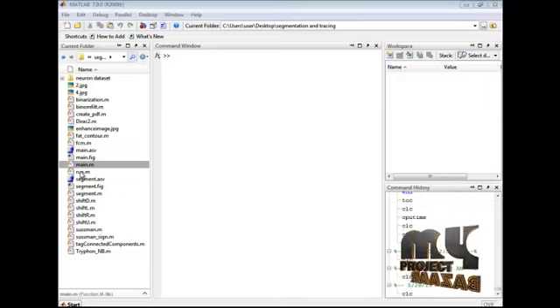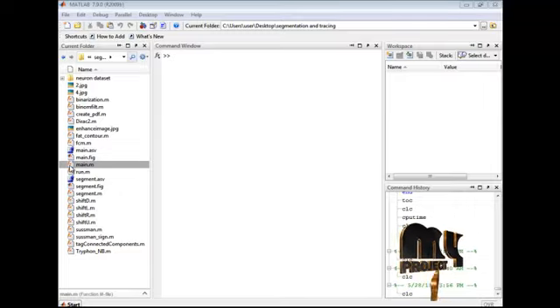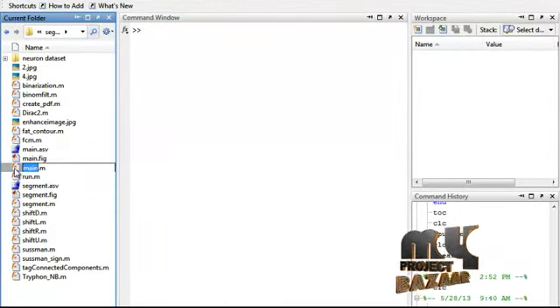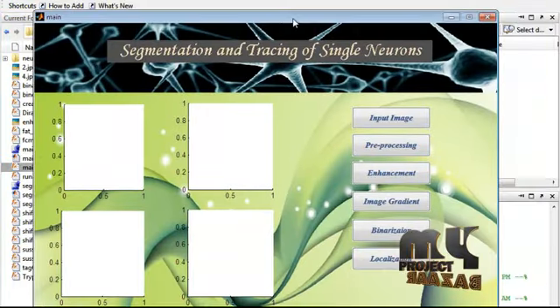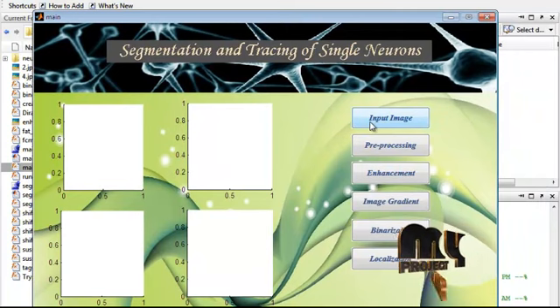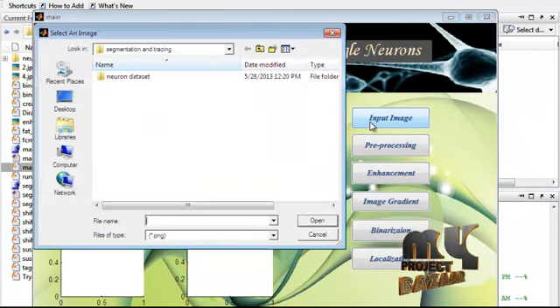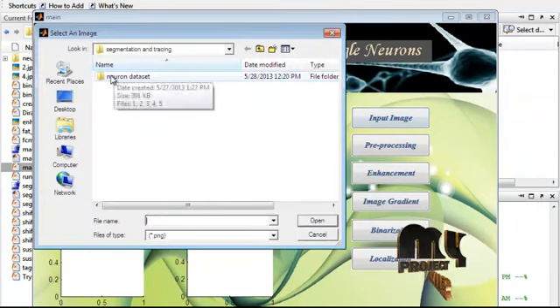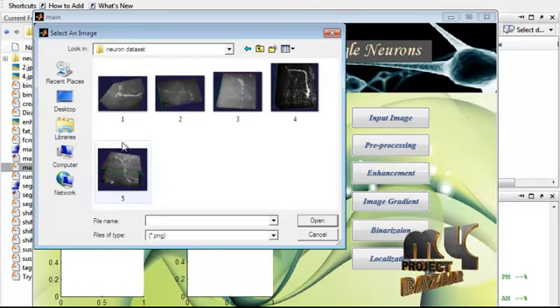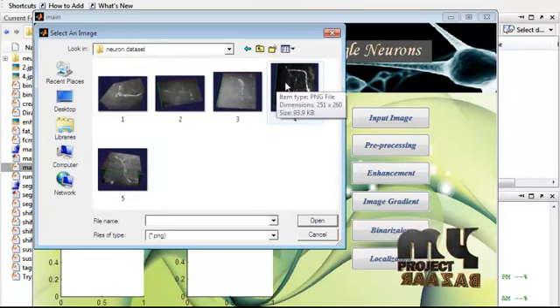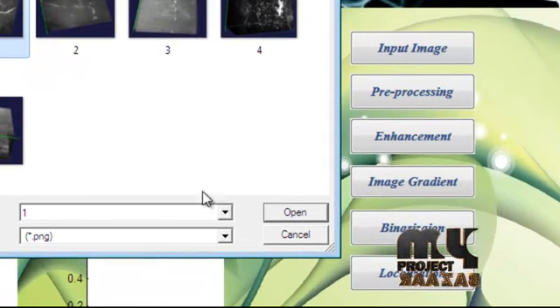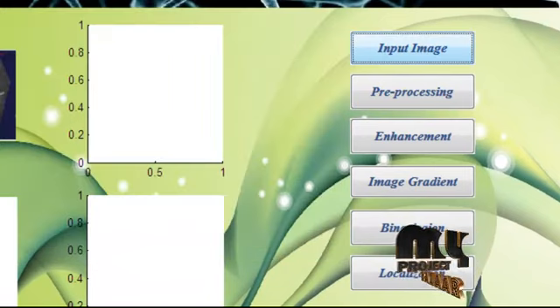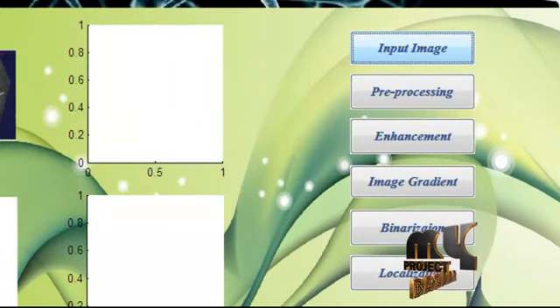Now let's see the execution part. Here I have the main.m file — this is the main file. Select this file, right-click, and run the file. The GUI window will open. Here we have to provide our input image. The provided input image is displayed in the first axis.